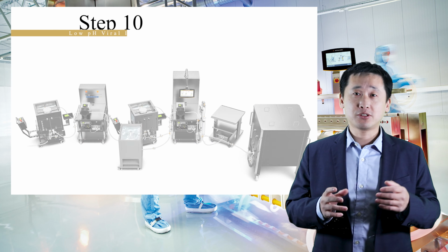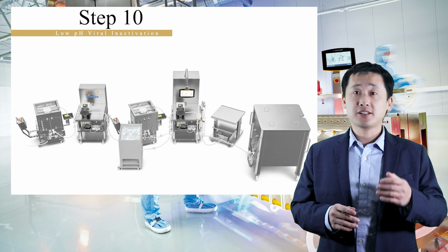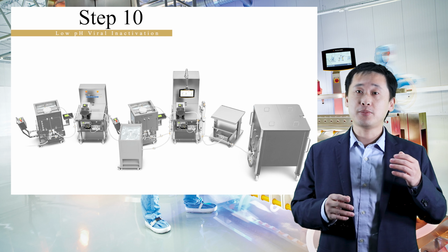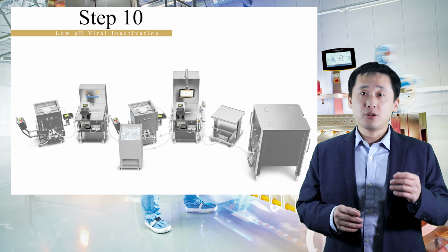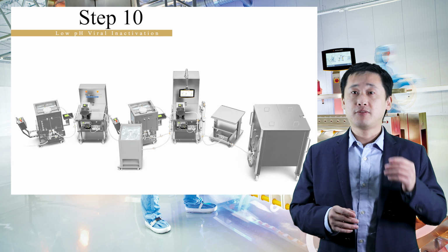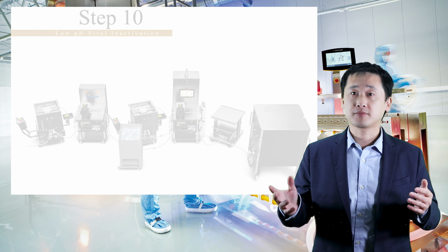Now, in step 10, we start looking at low pH viral inactivation. Now, the Flex-Act system can be reconfigured for virus removal through automated pH adjustment. Now, this automated low pH virus inactivation ensures precision virus clearance in the subsequent chromatography and polishing steps.